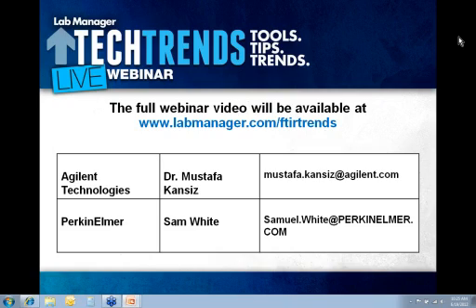One of our ExoScan FTIRs is now used to measure curing on the Boeing Dreamliner directly on the actual fuselage itself. So that's a classic example of taking the measurement to the sample, and I'm also seeing improvements required on the imaging side as well. That's neat. Yeah. Sam, your perspective?